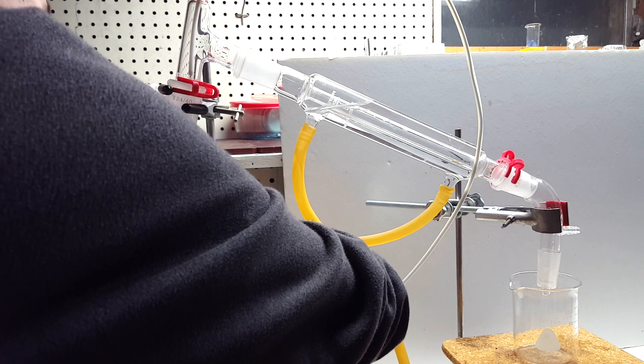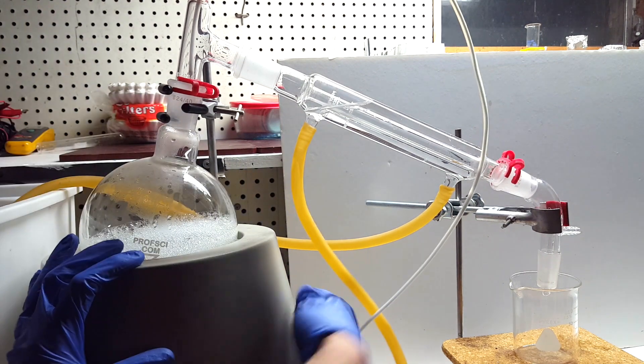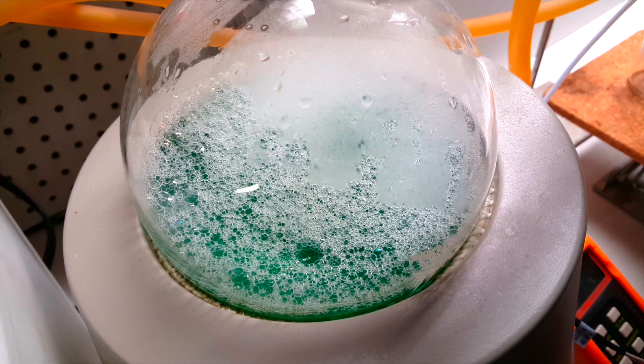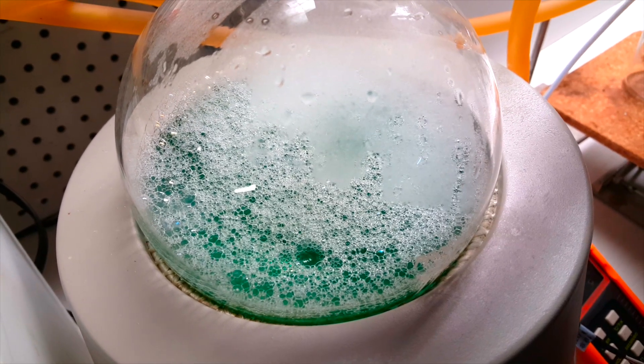I actually managed to damage my water pump, so it didn't put out enough pressure to fill the condenser, which was kind of annoying. It originally took quite a while for things to heat up.